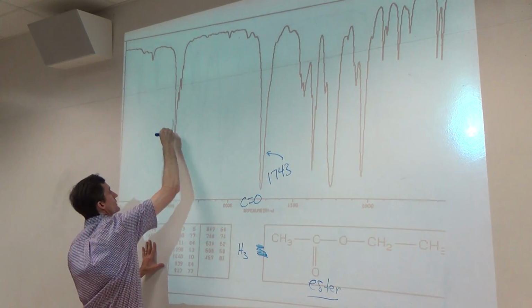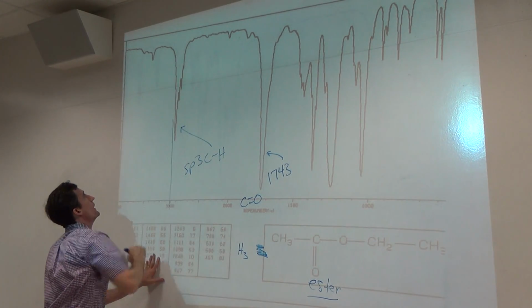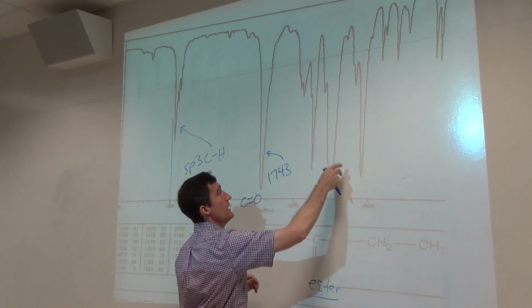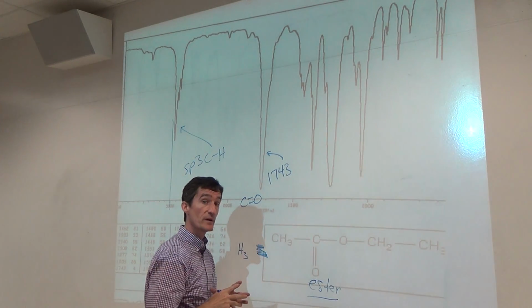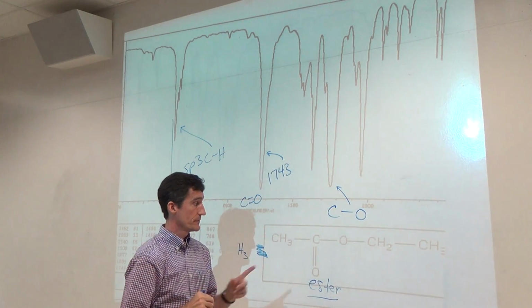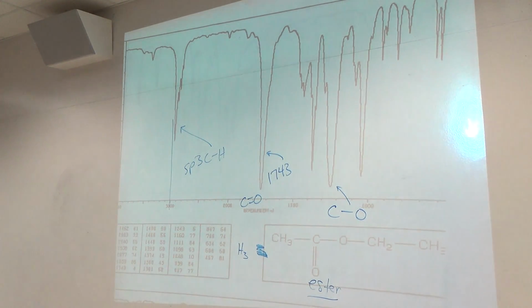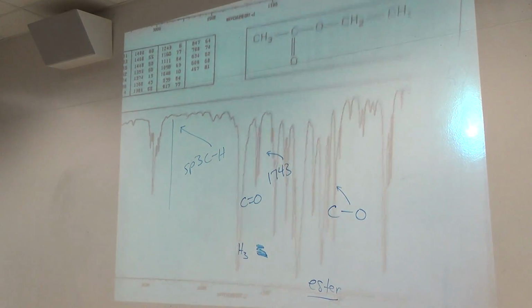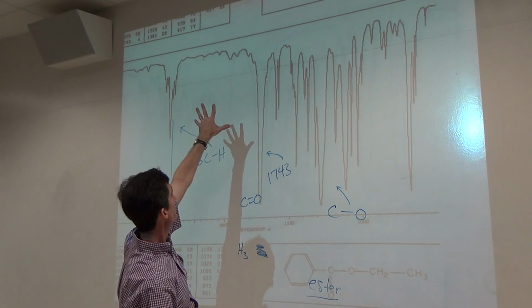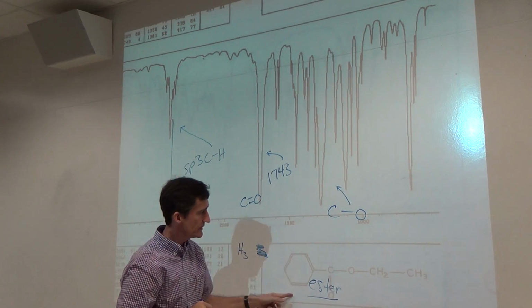We also have our sp3 CH. And then what looks like probably an overtone of the carbonyl. The rest is fingerprint. Pretty intense peak at about 1100-1200, if you remember what that might be, and likely is. Your CO single bond. Right here. Compound below is another ester. You can take a look at that on your own. It does have an aromatic ring, so you do want to look for sort of the aromatic signature and sort of peaks in this region. Carbonyl, sp3, sp2 CH there.